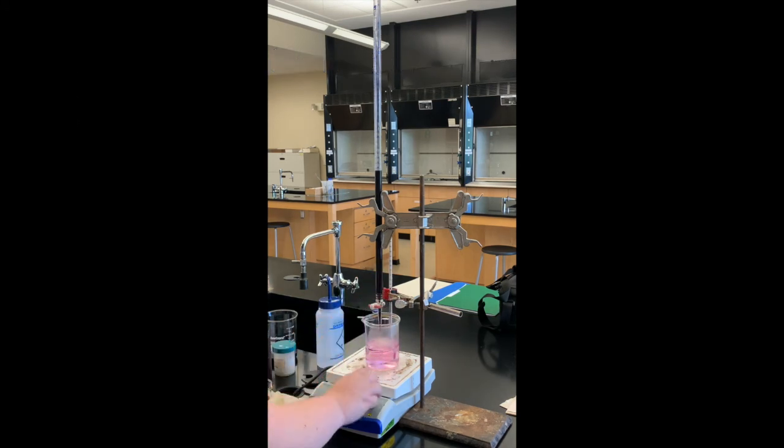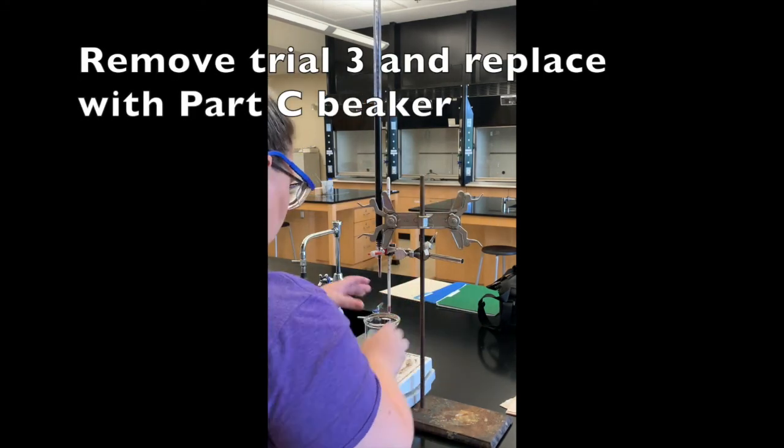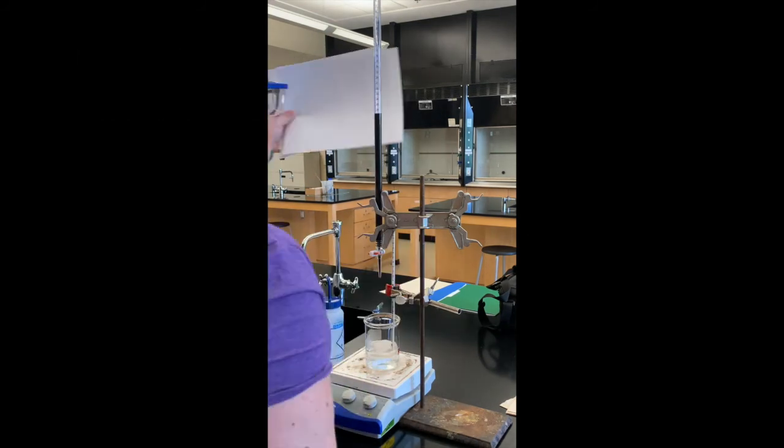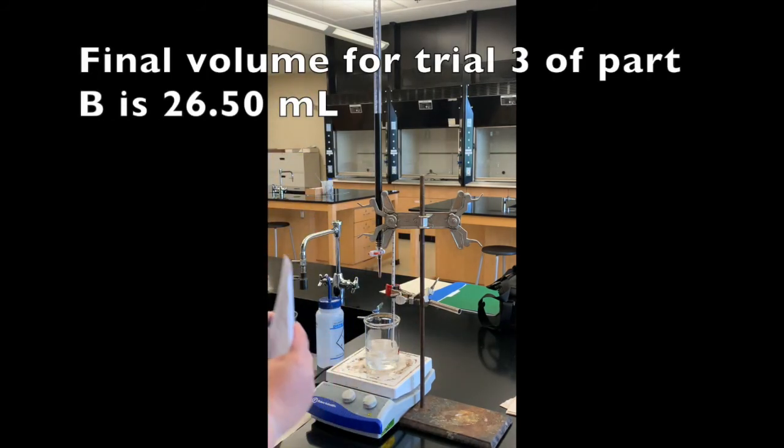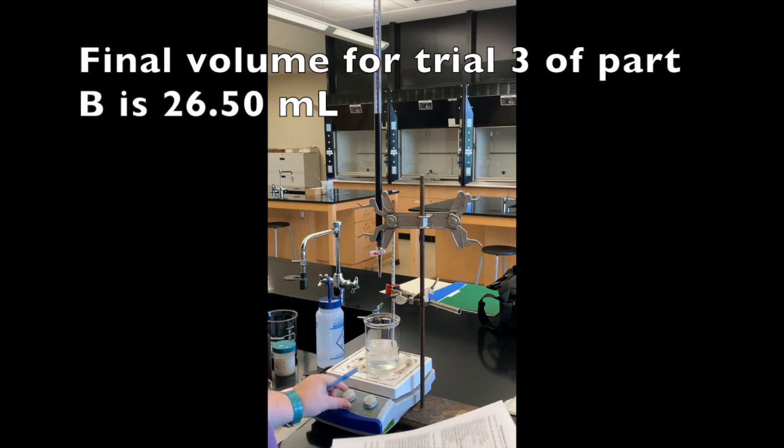Here we are at the end point, so I'm going to go ahead and take my final volume. The final volume for trial three of Part B is 26.50 milliliters.